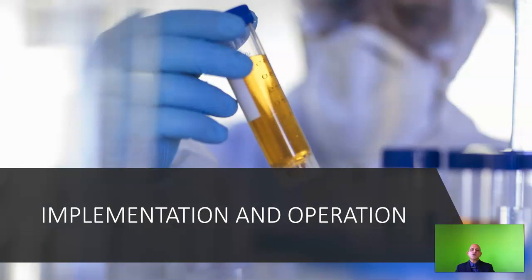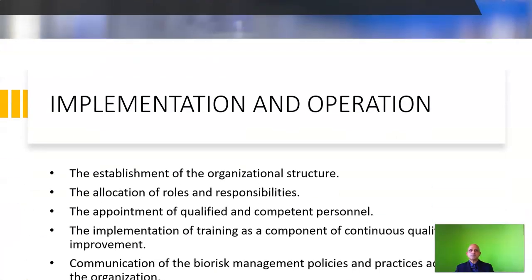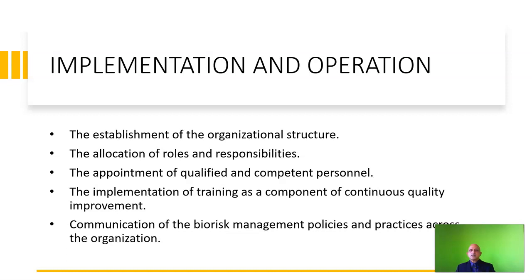Let us move on to implementation and operation. The first stage of a biorisk management system involves planning; subsequent to that, we implement this plan and operationalize it. Implementation and operation involves the establishment of the organizational structure, the allocation of roles and responsibilities to every member, the appointment of qualified and competent personnel, the implementation of training as a component of continuous quality improvement, and communication of the biorisk management policies and practices across the organization.